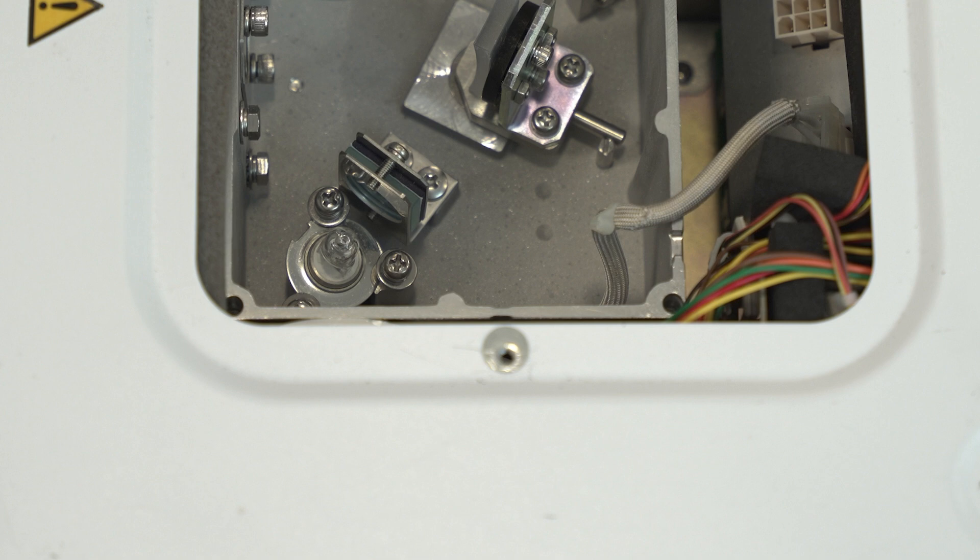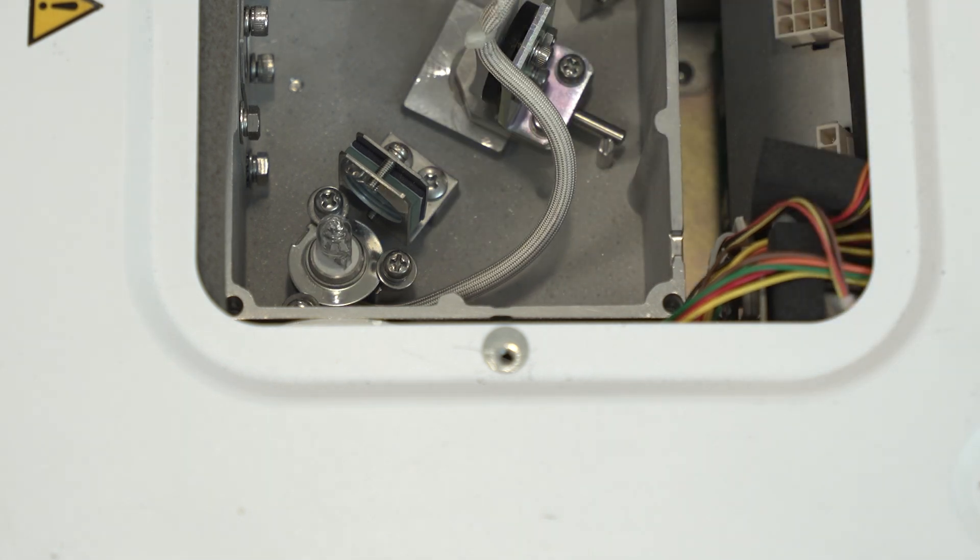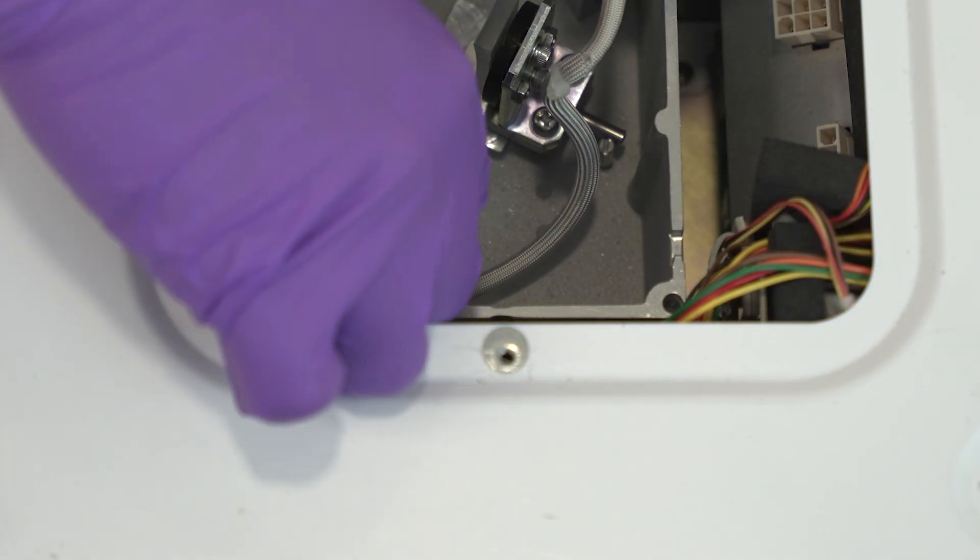If you have an SPD-40V UV-Vis detector, there is a tungsten lamp in addition to the deuterium lamp. Press down on the fastening while pulling the tungsten connector out of the plug.